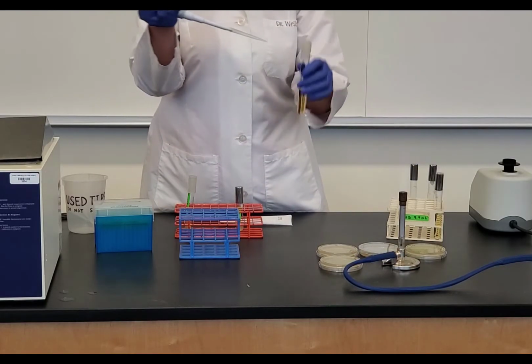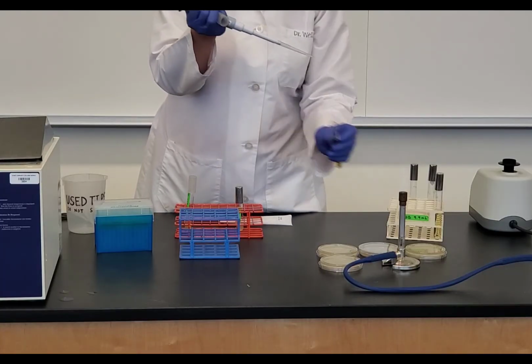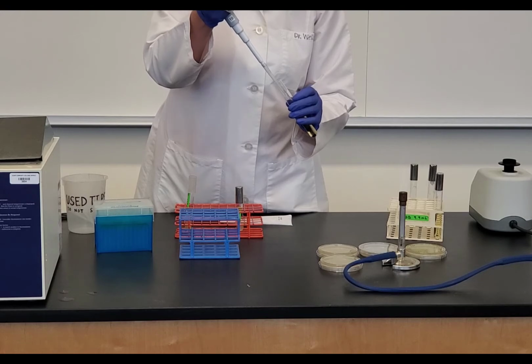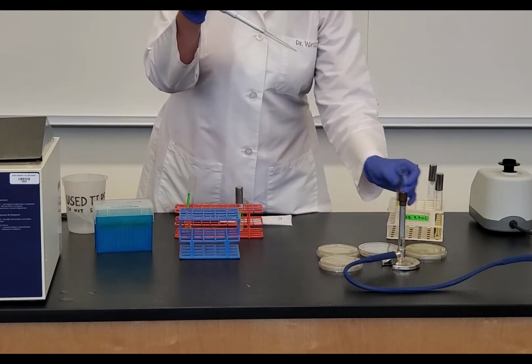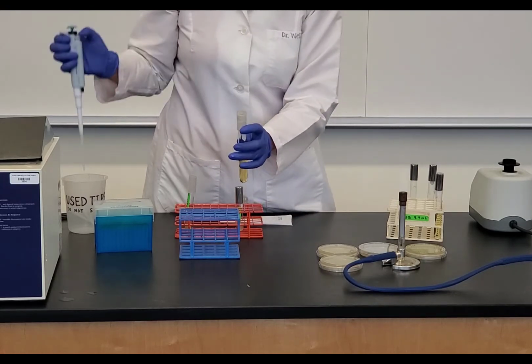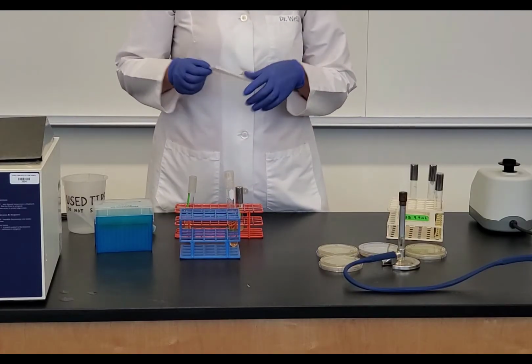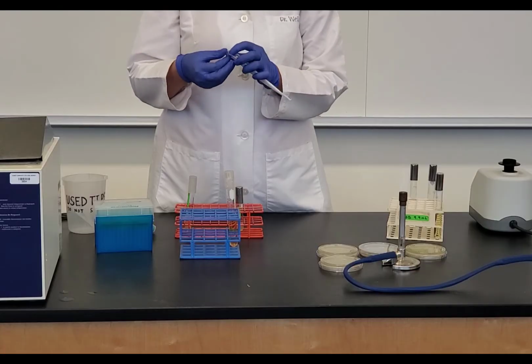I'm going to add that to my melted agar deep. Flame the opening, add it. Push all the way to the second stop to get all the liquid out. Take your tip, eject. Now I need to add my E. coli. Again, I'm going to add my E. coli using my transfer pipette.